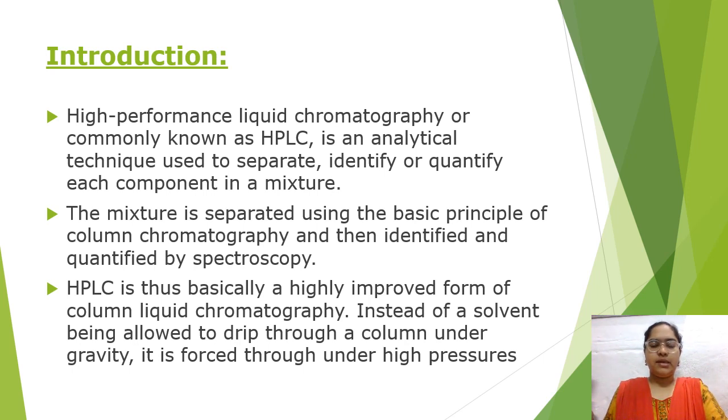So HPLC is a technique used to separate each component in a mixture, and the basic principle of HPLC is column chromatography. In column liquid chromatography, the solvent is dripped through a column under gravity, whereas in HPLC it is done under high pressure.